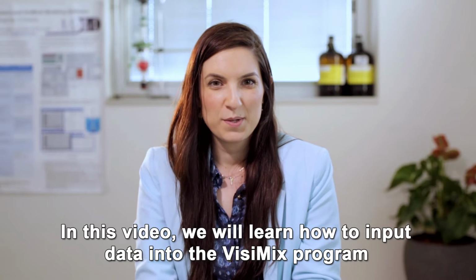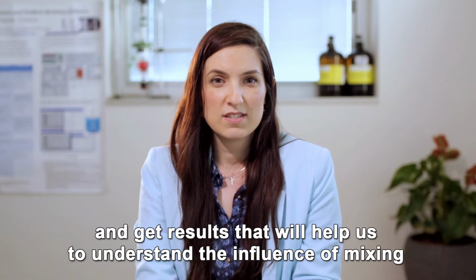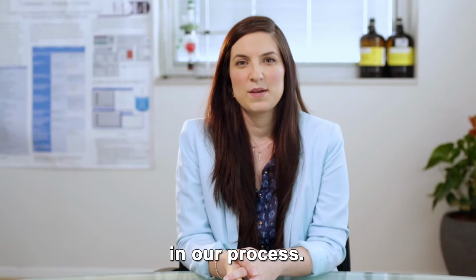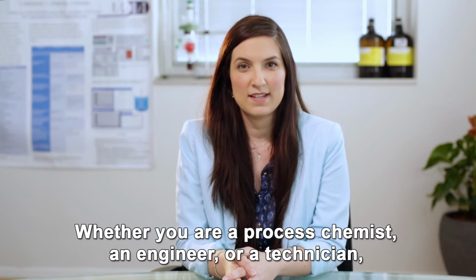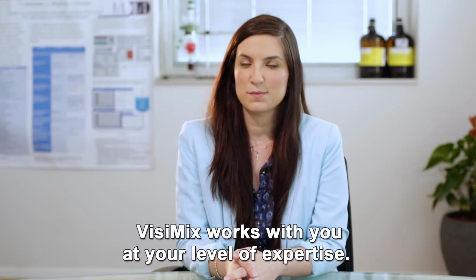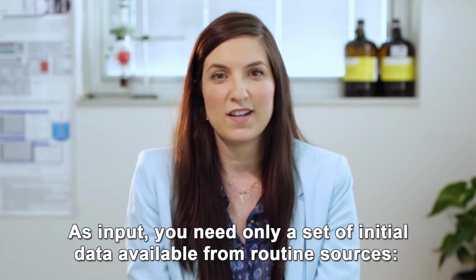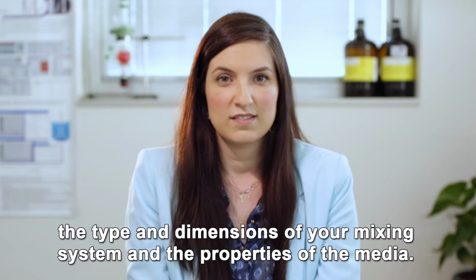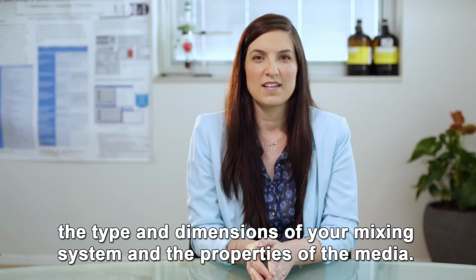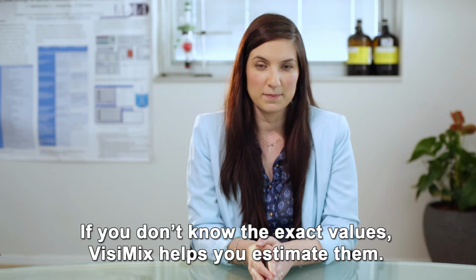In this video, we will learn how to input data into the VisiMix program and get results that will help us to understand the influence of mixing in our process. Whether you are a process chemist, an engineer, or a technician, VisiMix works with you at your level of expertise. As input, you need only a set of initial data available from routine sources, the type and dimensions of your mixing system, and the properties of the media. If you don't know the exact values, VisiMix helps you to estimate them.